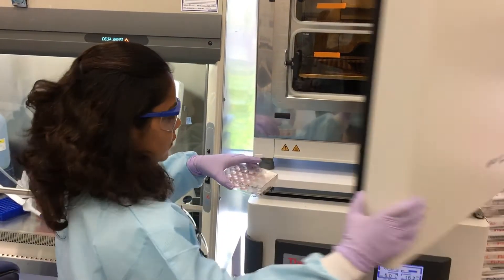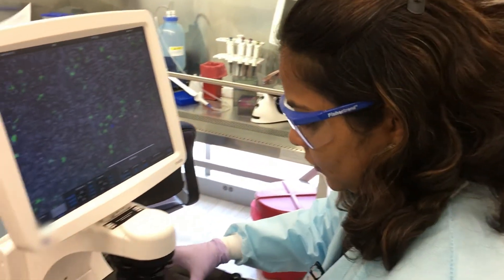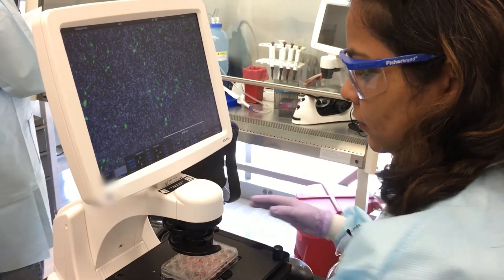I've been hearing a lot about CRISPR Cas technology. I want to learn more about it and see if we can use it in our lab. We're trying to generate stable clones. This is why I took this class and I'm learning a lot.